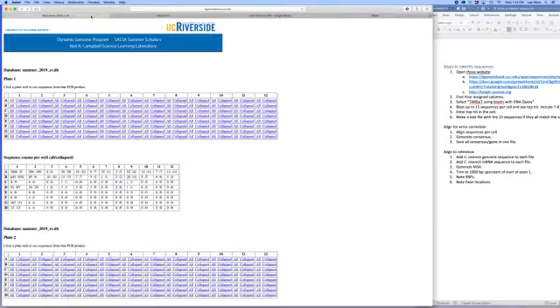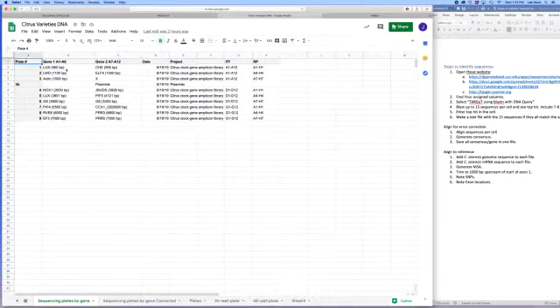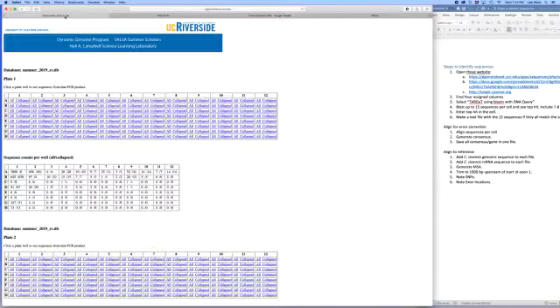So I've selected A1 from plate 1, and if we go over here to the varieties, it says that A1 in plate 1 is supposed to be Lux, the gene Lux. So A1 through A6 means these columns, 1 through 6, and then a different gene should be in 7 through 12, and the same DNAs are repeated. So the DNAs in A1 to H6 are repeated in A7 to H12.